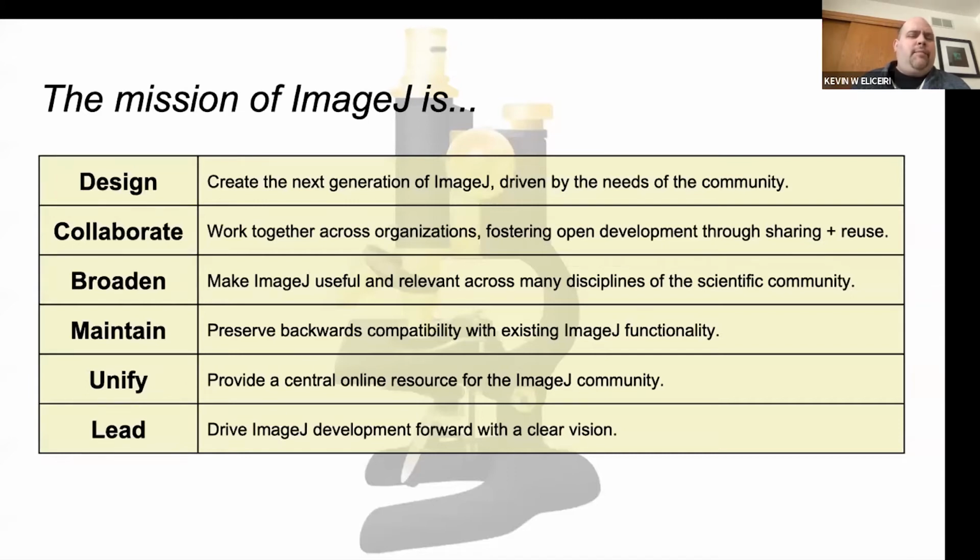And we've tried to really keep that element and try to add things to make it easier for them to contribute. We are continuously trying to make ImageJ more useful and relevant, including to other software tools. We're delighted that, for example, now ImageJ plugins can be used in other packages. We'll talk more about that. As you might imagine, the big elephant in the room, of course, is that ImageJ is Java-based, and we recognize the power of other languages, including Python. I'll talk a little at the end about how much we're trying to work on Python, and that really is the main focus of Curtis Rueden's work as a fellow that I'll talk about this afternoon, of really focusing on Python support in the ImageJ world. And then we really want to have a central online resource, which has been a major emphasis of COBA, but also our CZI work, of having a place where you can go not only for ImageJ work, but any image analysis help, like the forum and other resources, and having a clear vision of the future, which is keeping things working, but also adding new support for new modalities, such as light sheet.